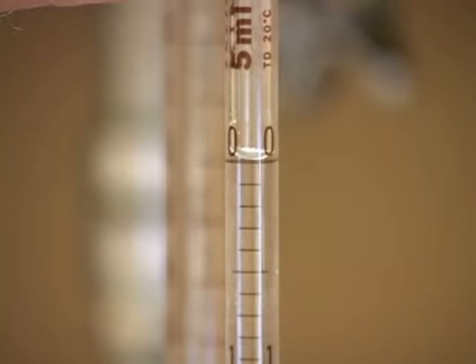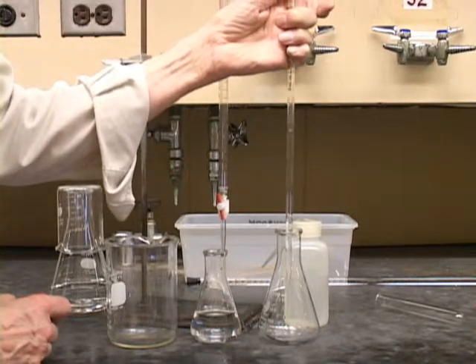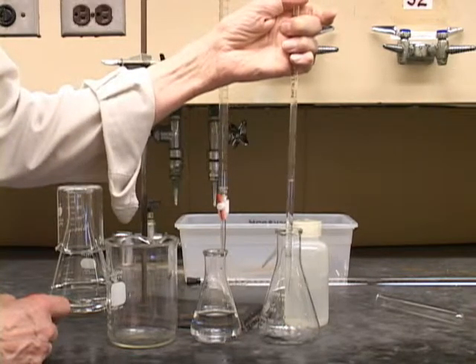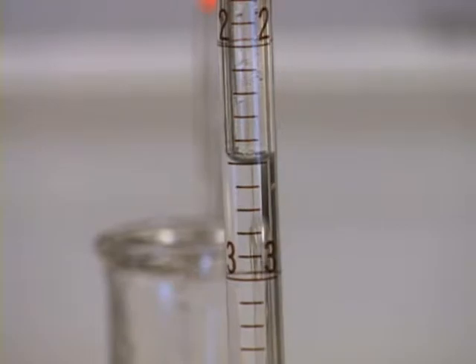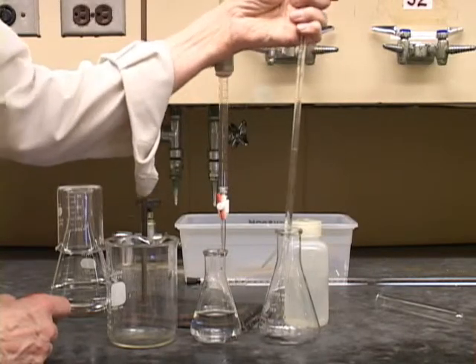All right, here it is at the 0 mark, and drain it in here to collect it until we get exactly to the 2.5 mark. All right, here it is exactly at the 2.5 mark. Hold it there for a second and touch it to a side.